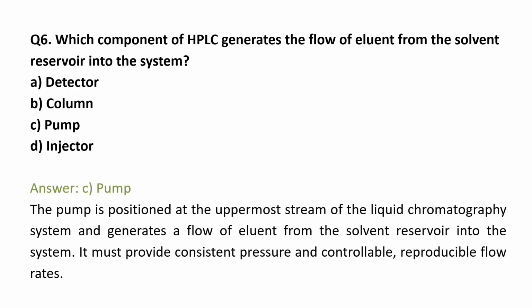The answer is pump. The pump is positioned at the uppermost stream of the liquid chromatography system and generates the flow of eluent from the solvent reservoir into the system. It must provide consistent pressure and controllable, reproducible flow rates. So this is essential for efficient separation of analytes.